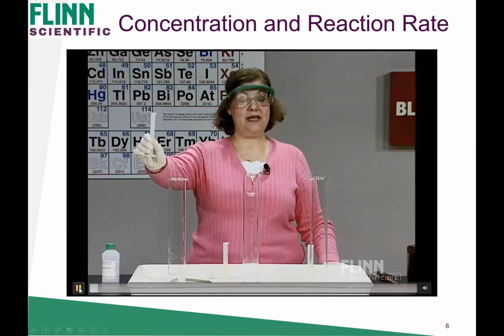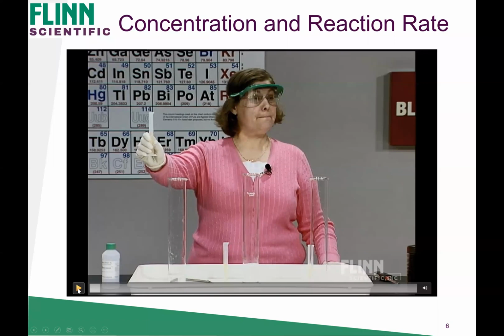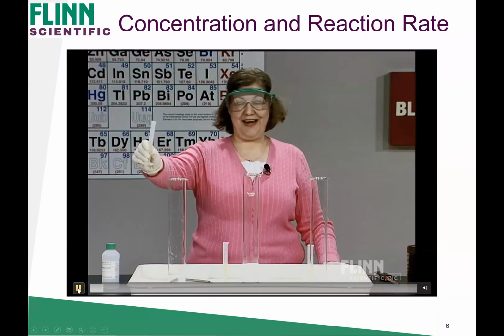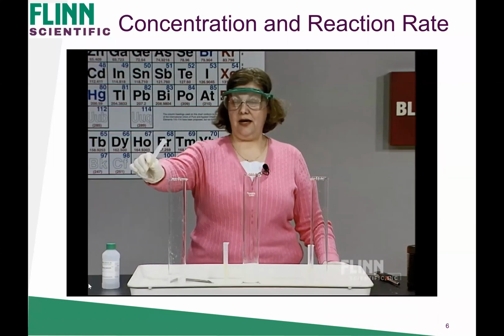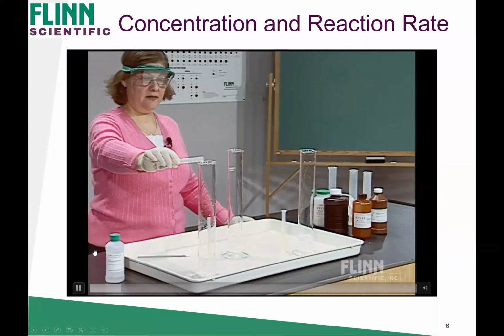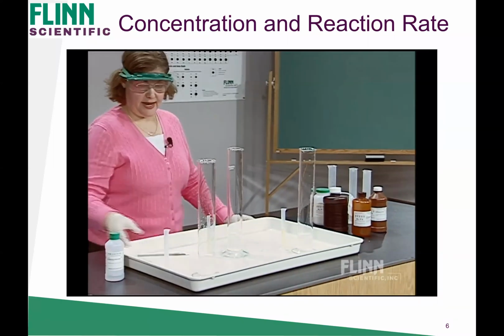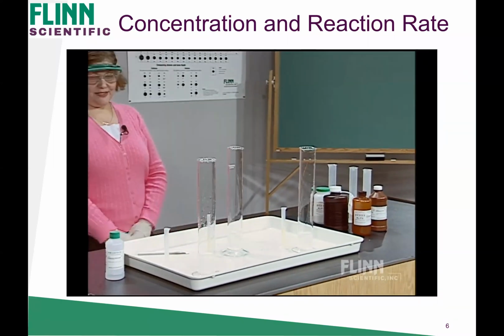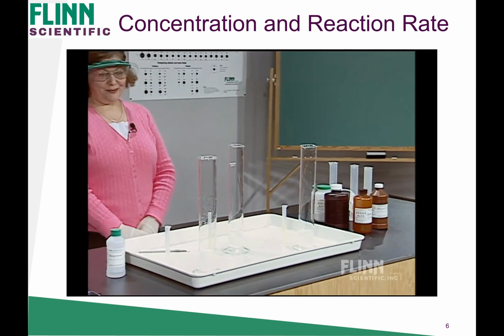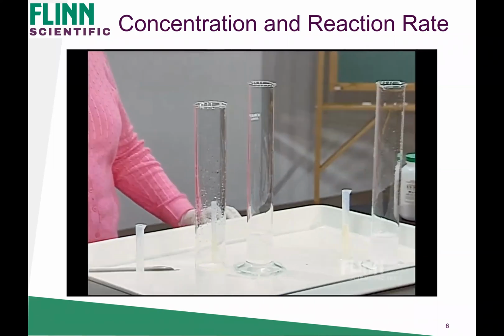So, I've taken away the audio from this, so you won't hear any audio, but let's observe this first reaction. She's adding her catalyst to hydrogen peroxide, so get a qualitative feel for how fast this reaction occurs. Think about this in contrast to the first demonstration you saw, where we added sodium iodide to hydrogen peroxide and you formed a giant poof right before your eyes very quickly.